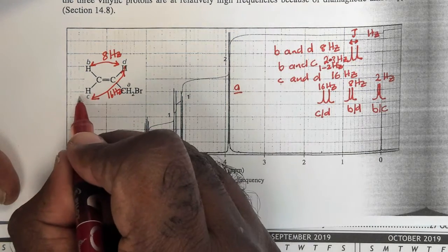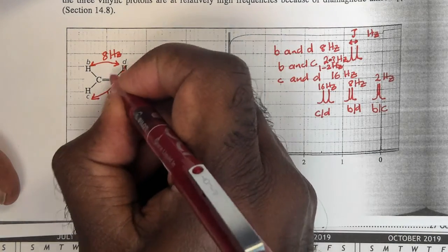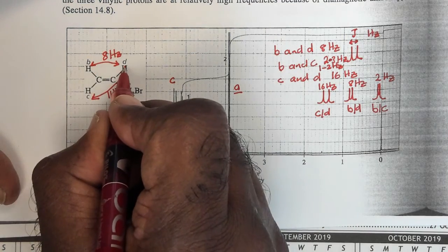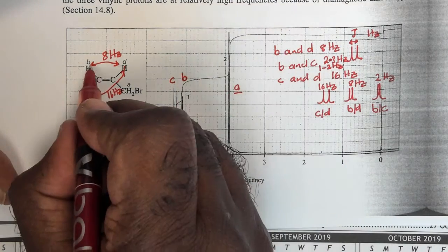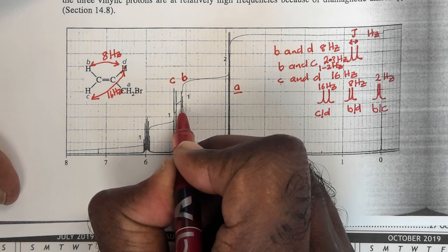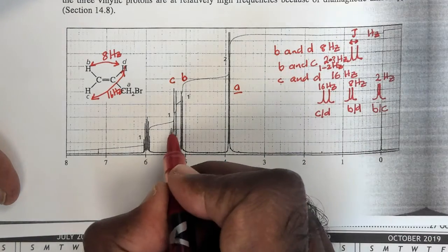Right? So this C proton split by D must be the larger one because it's seeing trans coupling, and this B being split by D must be the smaller one because I have cis coupling here. So this is trans coupling and that's cis coupling, and there's my trans and cis like I've showed you here. You can see one is big, one is small.